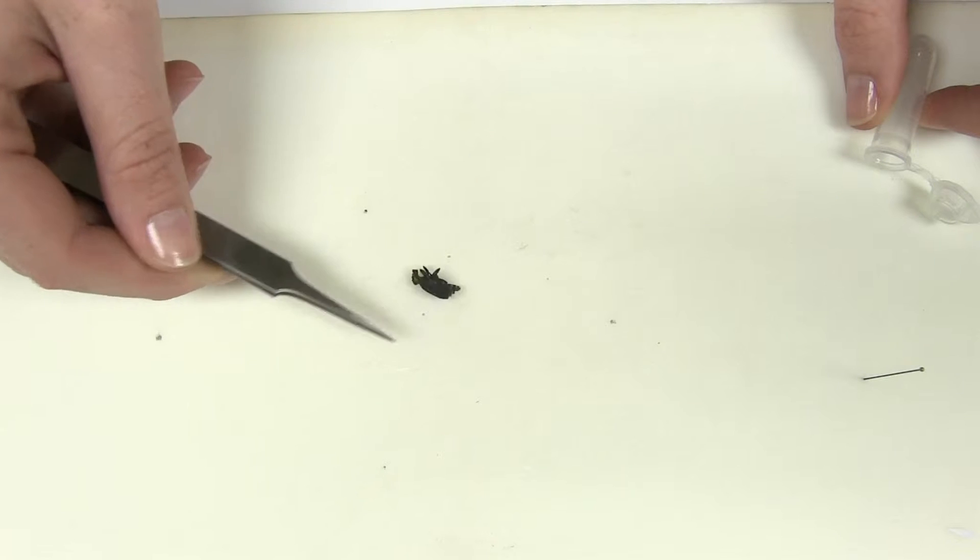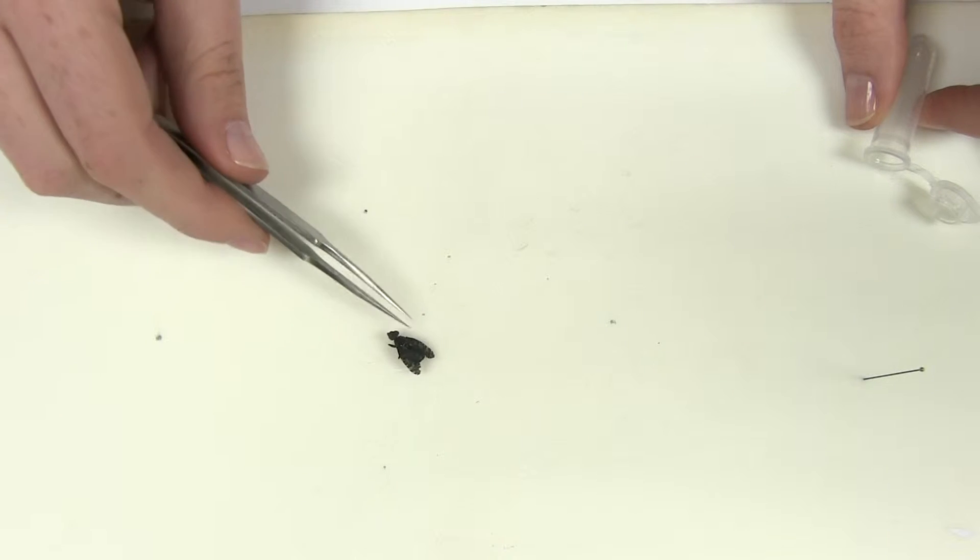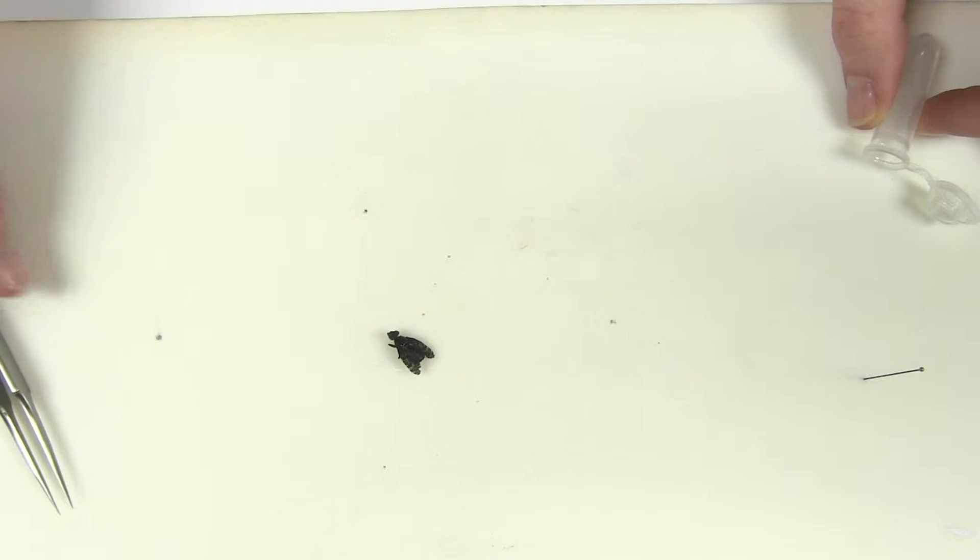For storage of small and soft bodied insects like this fly, it's sometimes best to store them wet rather than pinning.